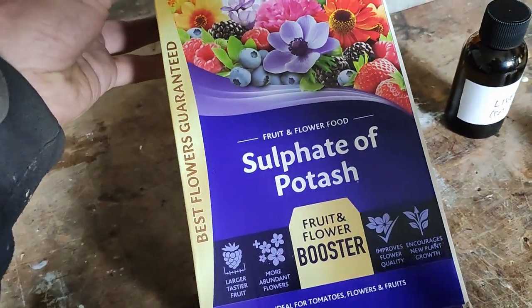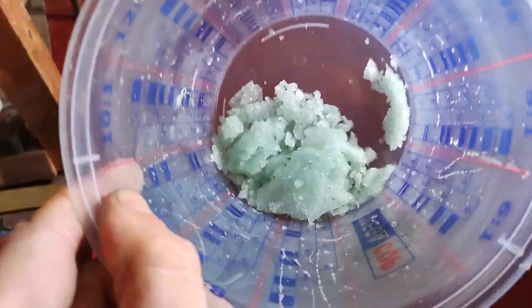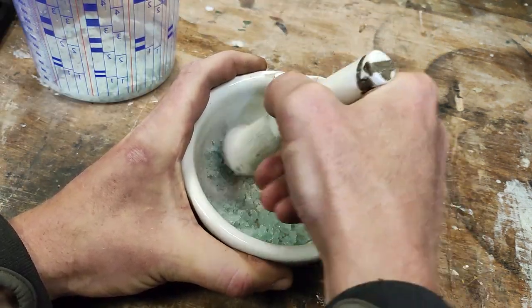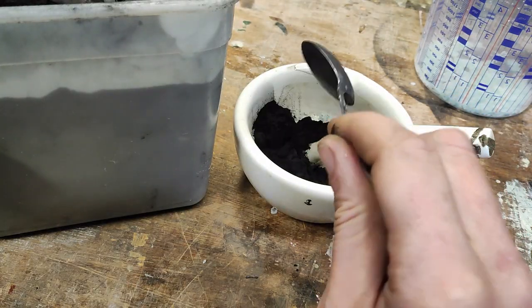Do you like the smell of rotten eggs? Well, if you do, you should try making some potassium sulphide. I made it from potassium sulphate that I got from the garden centre. I recrystallised and then crushed up the crystals, to which I added charcoal powder.